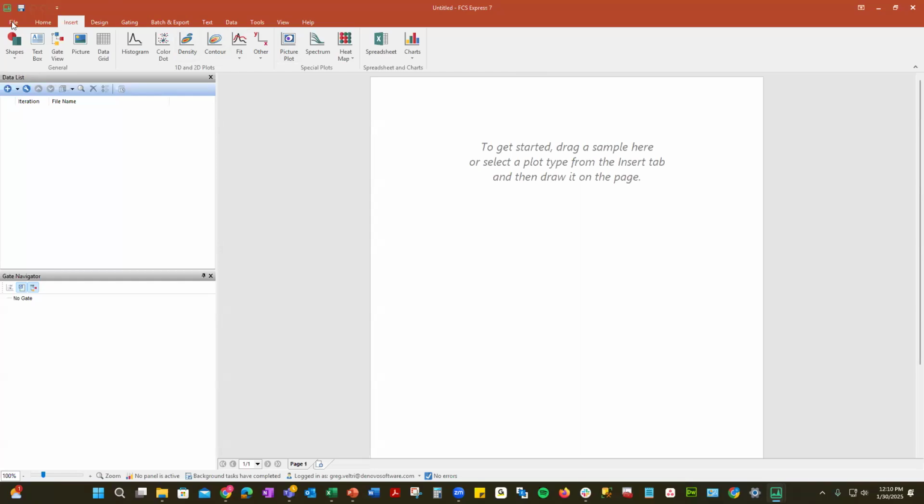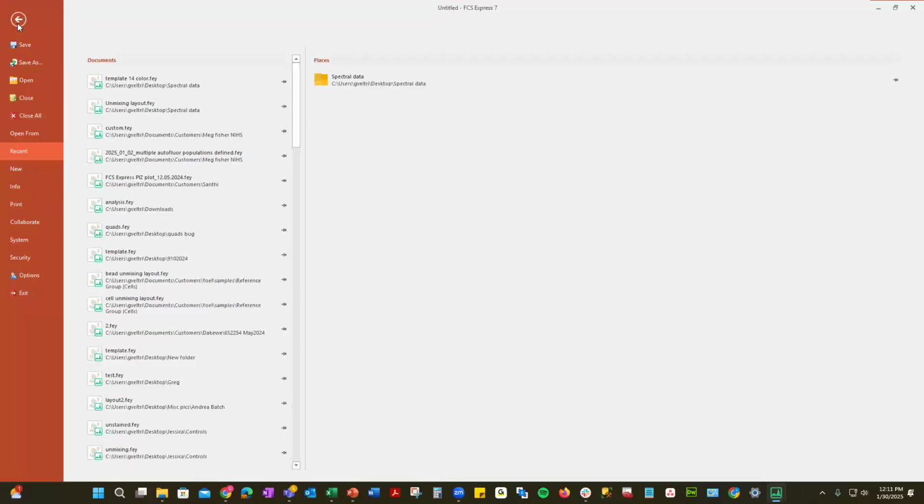All right. So now we'll go through some of these tabs. You'll see we have windows here, some information. So let's start with the tabs. The file allows you to go to different items like save as, save, open. There are different things here, but one of the things that's very common for us to talk about when you discuss things with us is the options button.